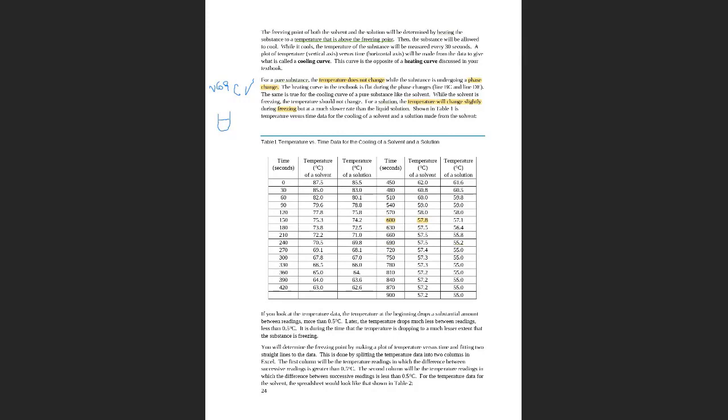And then you let it cool down, and you basically record while it is cooling. You will measure the temperature of the substance every 30 seconds. Here it is showing the time. This is an example, a quick overview. It's called a cooling curve. So you will have a curve.